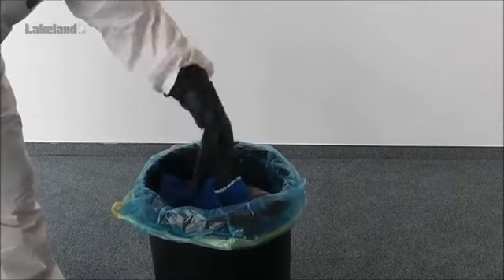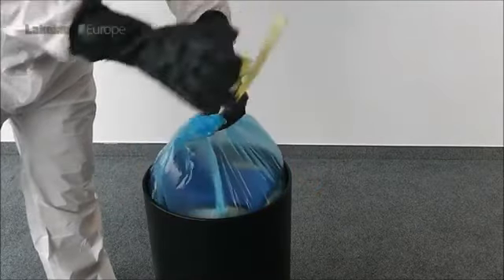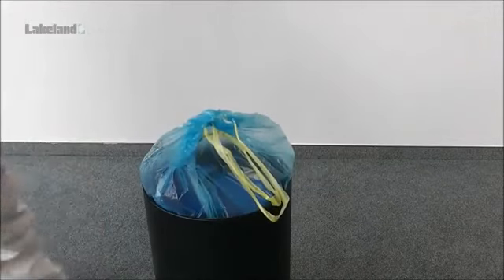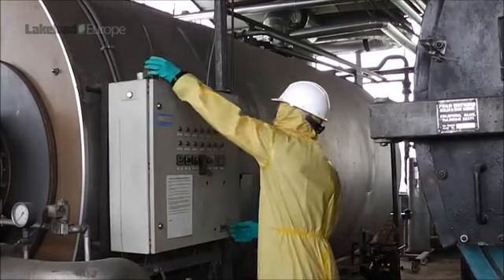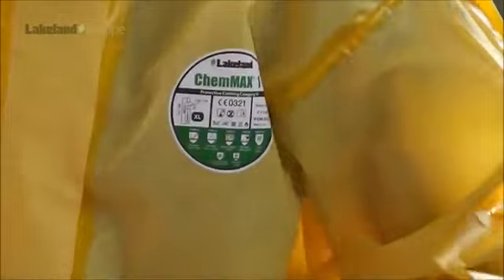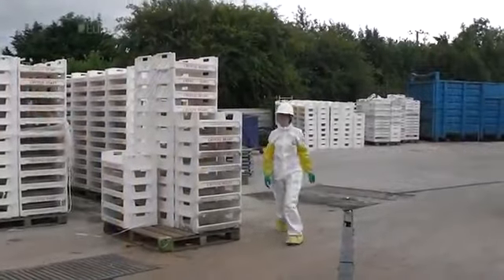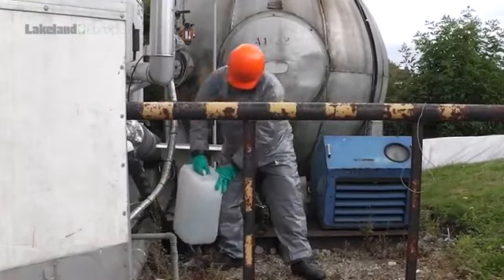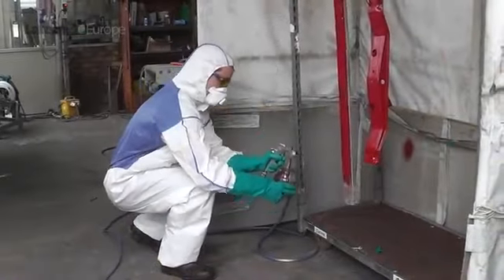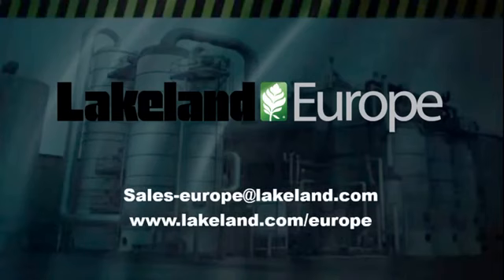Finally, the assistant's gloves and coverall, if contaminated, should be placed in the disposal bag with the wearer's used PPE. Remember that the gloves may now be contaminated, so the assistant may need further assistance to remove them. Lakeland Chemmax chemical suits are designed and manufactured to the highest specifications and quality. Suitable procedures in use ensure a high level of protection. The donning and doffing procedures shown here may not be precisely appropriate to your situation. The requirements may vary in different applications, and it is good practice to conduct a risk assessment of donning and doffing procedures just like any other hazardous situation. Our Lakeland sales managers will be happy to discuss your requirements. Ensuring proper donning and doffing procedures are in place will contribute to improved site safety. For more information, contact Lakeland.